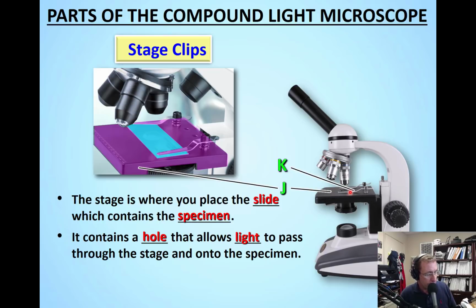And you can see ours are exactly like that. They're kind of spring-loaded, so they have some tension down, so you have to lift them up, but you move them out of the way first, get your slide positioned, then lift them and rotate carefully and hold the slide down with your specimen. Okay, again, don't ever try to jam your slide under. That's likely to break the slide and or scratch the stage and or ruin your specimen. Okay, so you have to be careful with these. They're not indestructible. All right, again, pointing out with yellow now where the clips are on your stage.